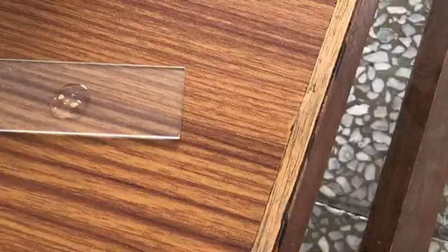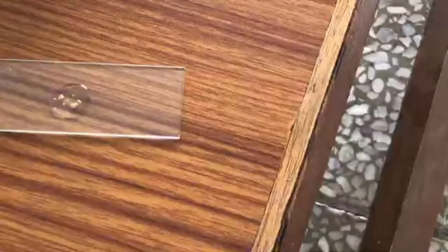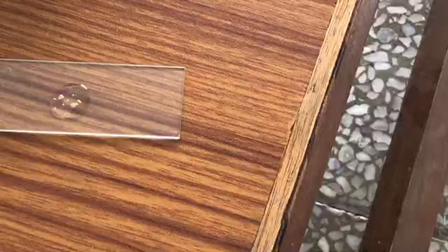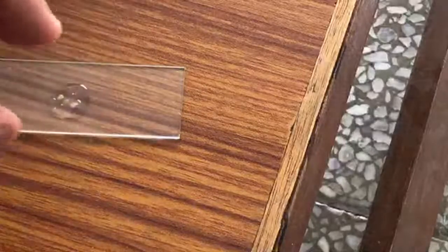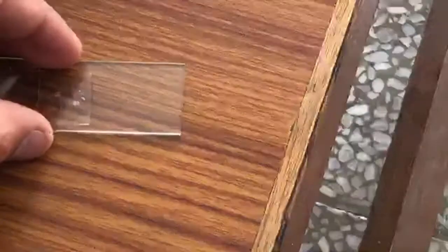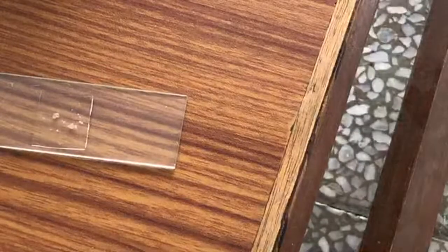Now we take a cover slip or the cover glass, whatever you prefer to call it, and place it. This cover slip is a clean one, we place it gently on this. Done. That's it. Now we'll put it under the microscope and start our observation.